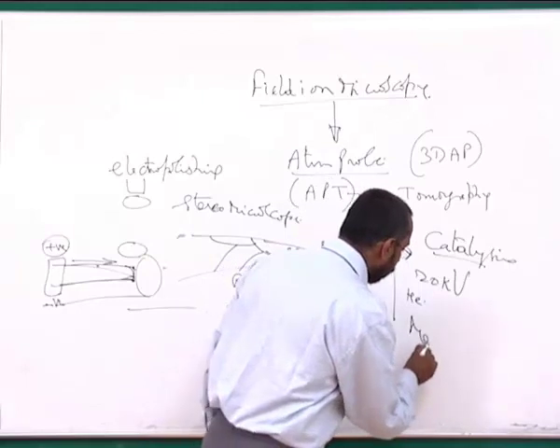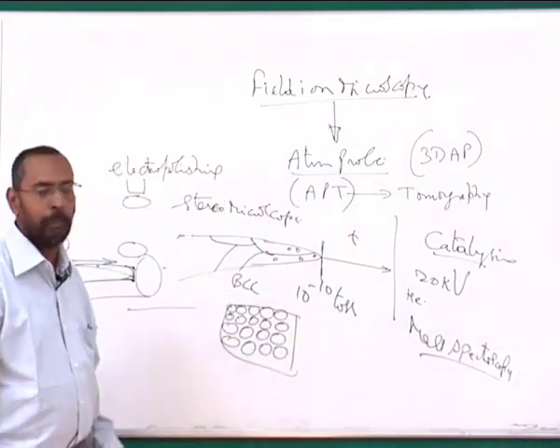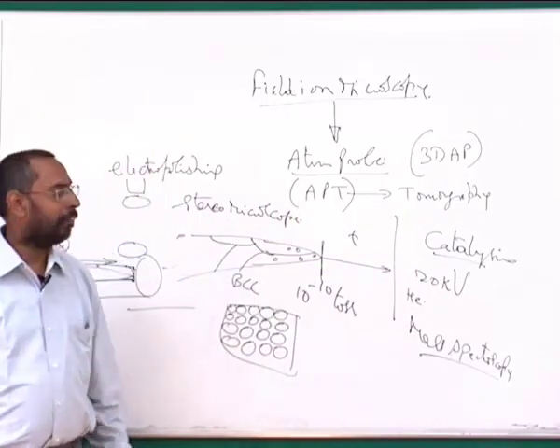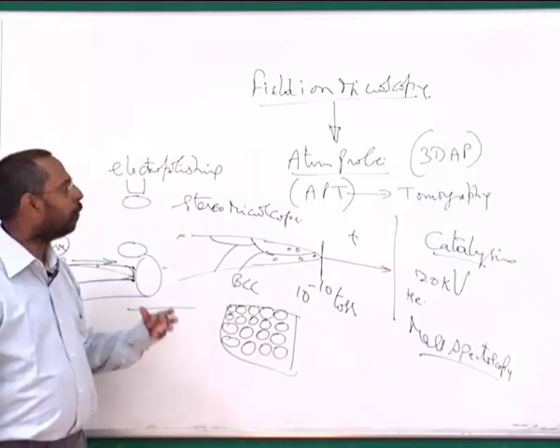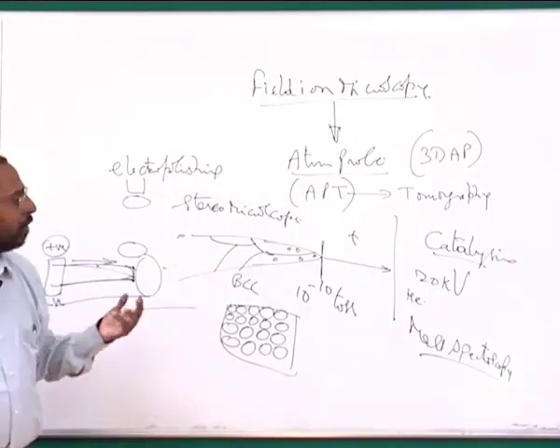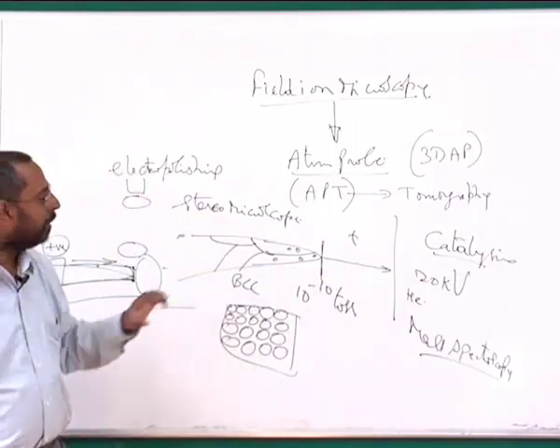This is what we usually call mass spectroscopy. So using these principles of mass spectroscopy, you will be able to know what atoms are reaching, and layer by layer, if you can sputter away and accumulate all these layers, you will be able to know in 3 dimensions how the particular material has atomic arrangements. So you can get a complete atomic arrangement distribution inside a material.